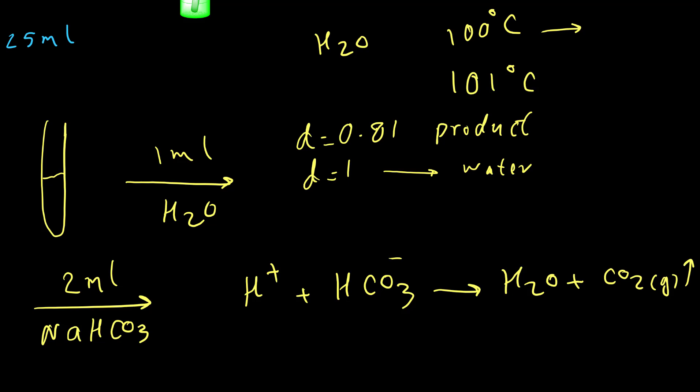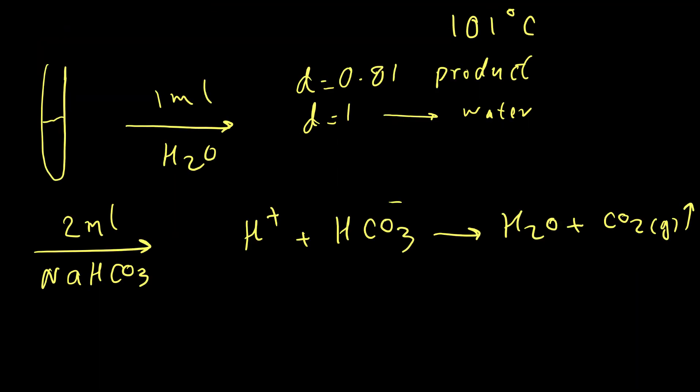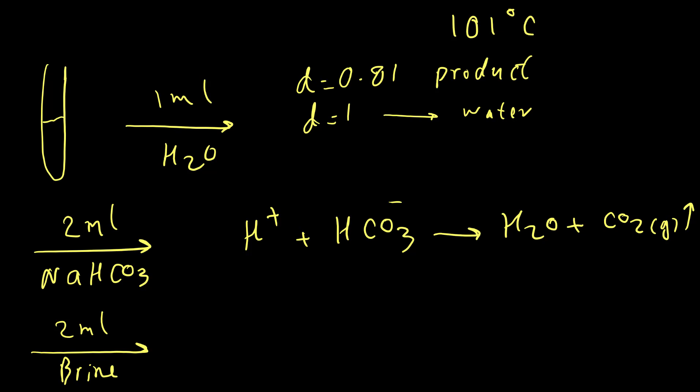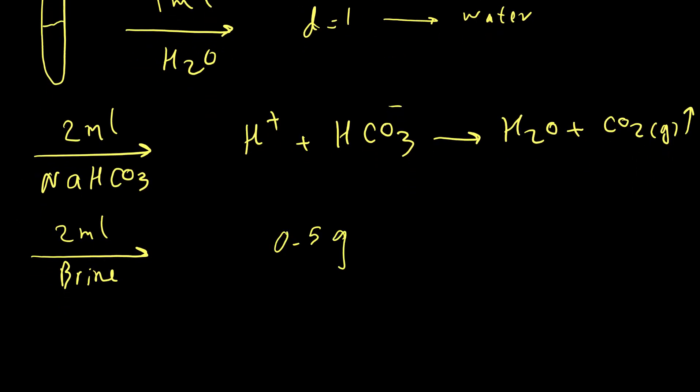That means we don't have any more acid and our acid is completely neutralized by sodium bicarbonate. Then again, we need to remove the aqueous solution once two layers form. Then add 2 milliliters brine or sodium chloride solution to the organic phase and close the cap again and shake it slowly to remove the trace of water remaining in the organic phase. Then we can dry our organic phase with 0.5 grams sodium sulfate. We are going to add 0.5 grams sodium sulfate inside the tube. Keep in mind, in each step we need to remove the aqueous phase when we want to move to the next step.